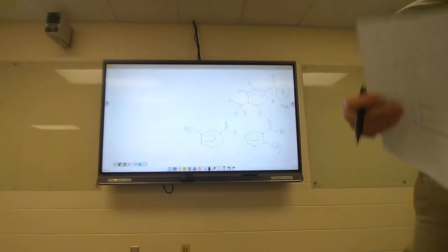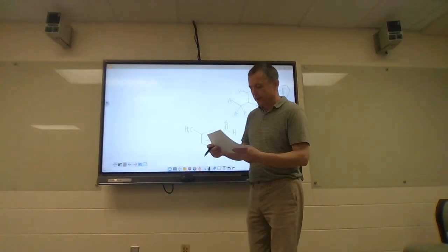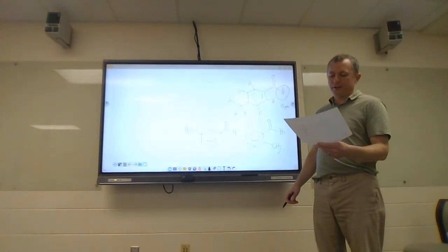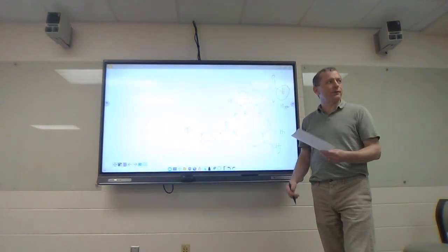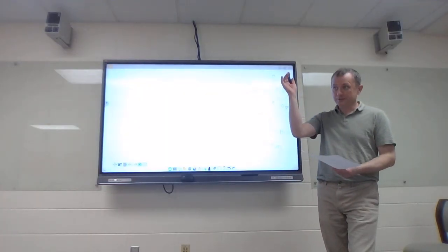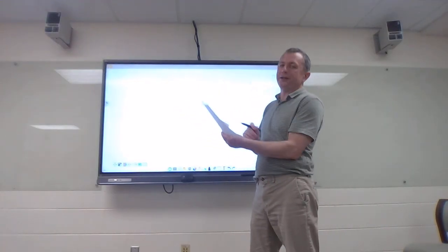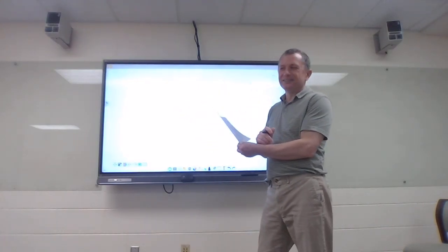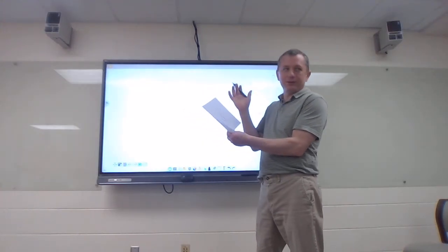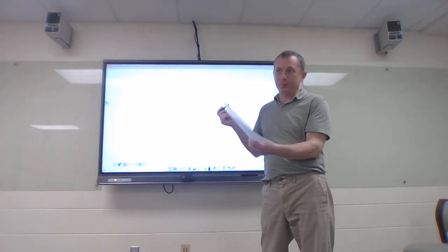Yeah, let me show you 7 and 8, where I do not have IR for these because I pulled them off the internet. This is much more likely what you would see on an ACS standardized test. I find them annoying because they're really hard to read. They oftentimes don't give you the integration. They oftentimes don't even give you the peak picking. And I'm like, who does that, right? I had to draw the integration in and then put the integrations on there, because all it did was give you the spectra. And then you have to kind of imagine what the actual ppms are.